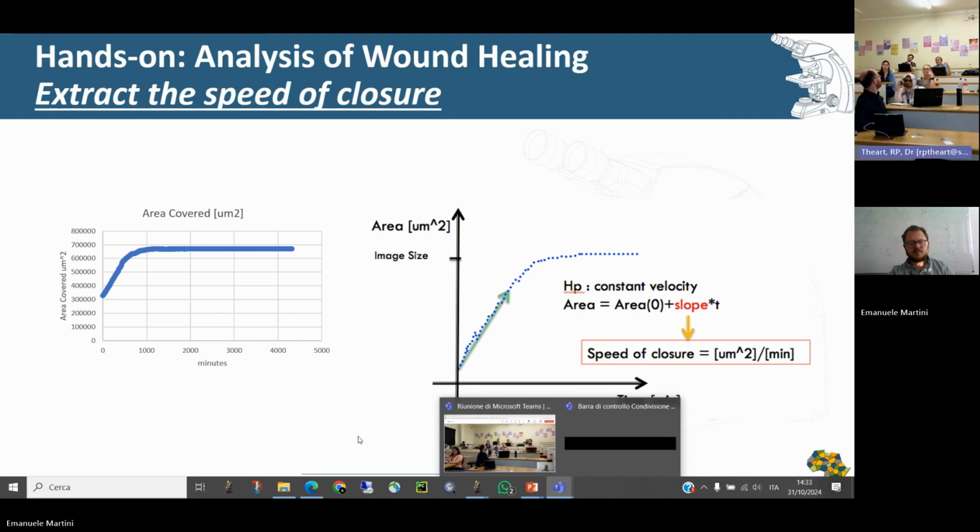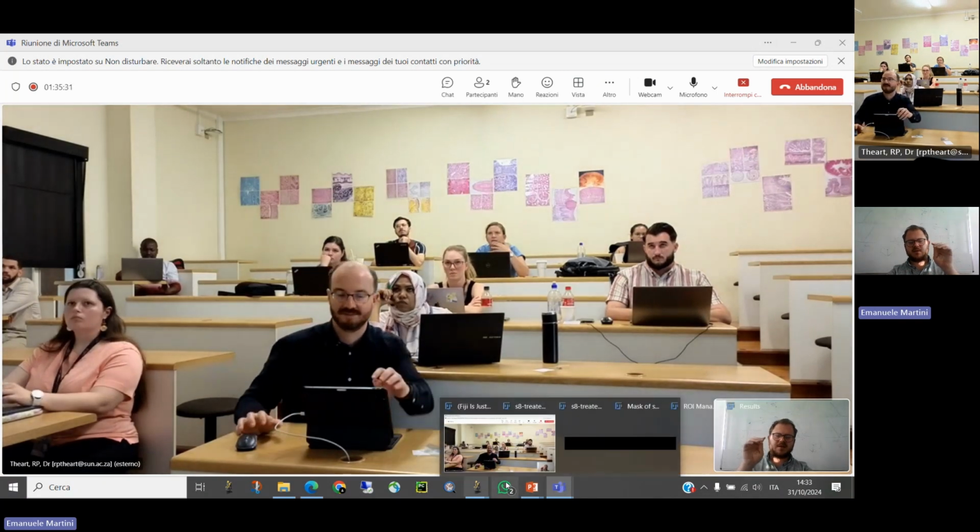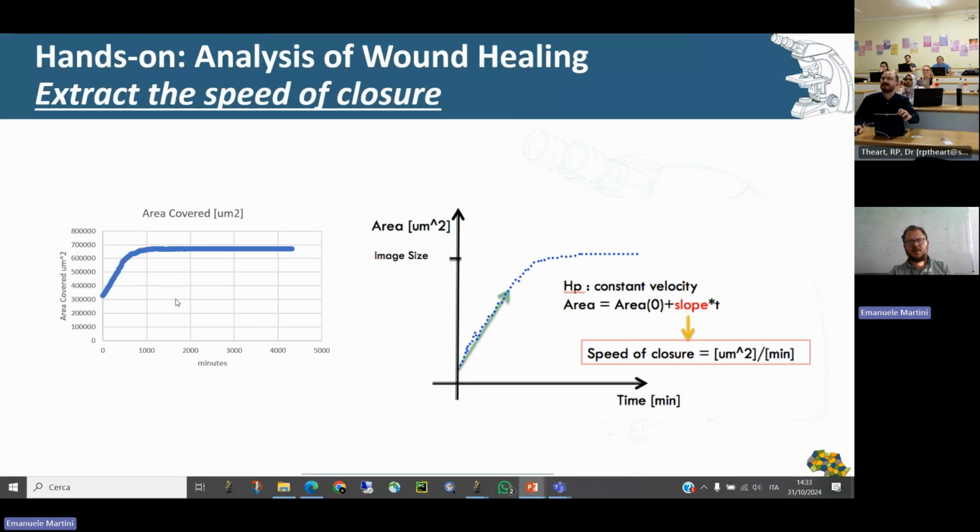Yeah, you say that. The fact that it's flattened, so you're asking only the increasing plot. If I understood well, you were saying that you only need a piece of the data, no? Only the beginning. Because if not, you will fit also these data points. This is the problem. If you take all these points, of course, your fitting line will be something like this, no?